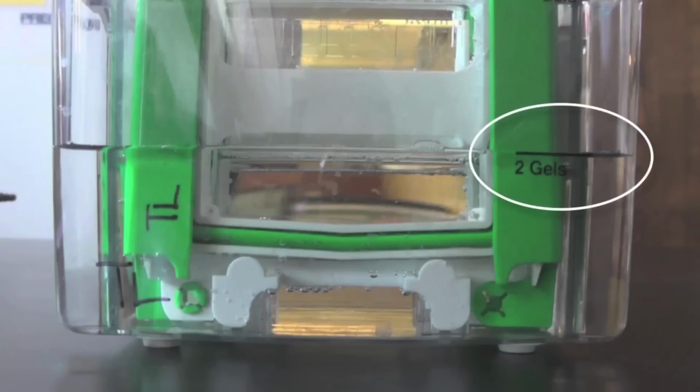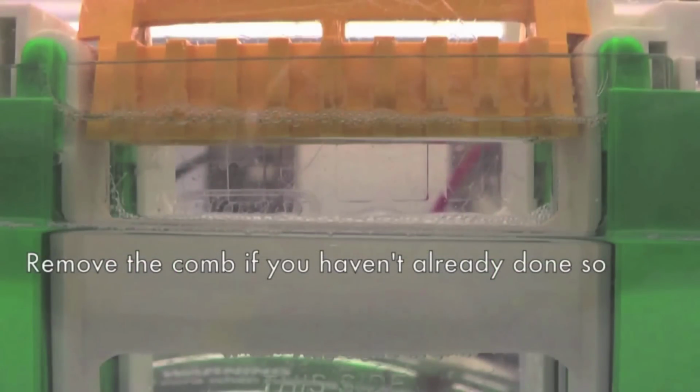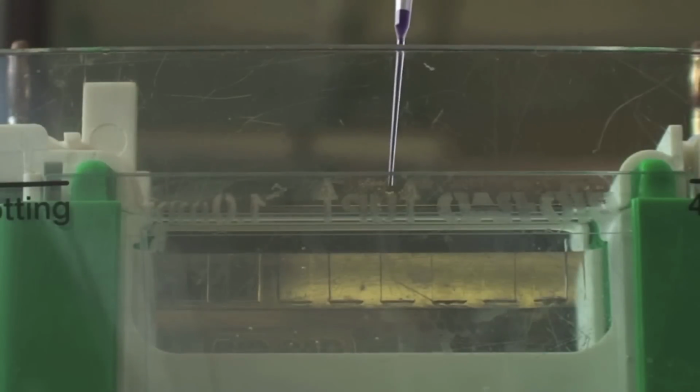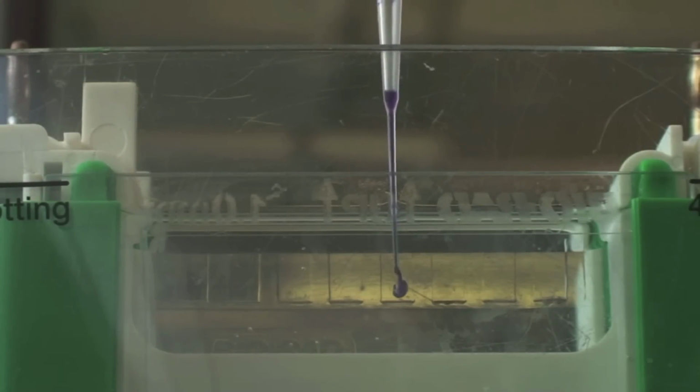Now you're ready to load the samples. Remove the comb so you can see each well clearly. You can install the loading guide on the gel to make it easier to load your samples properly into each lane. Carefully load 10 microliters of sample solution into each well.